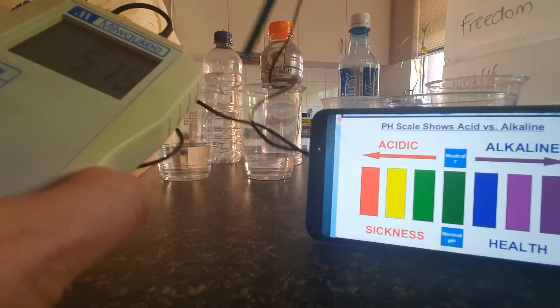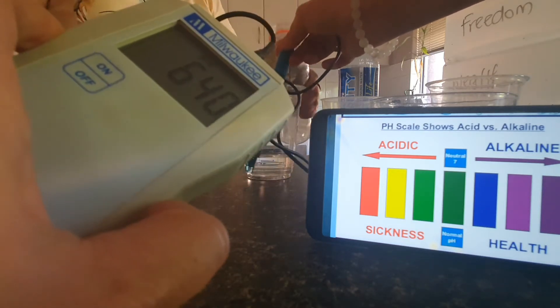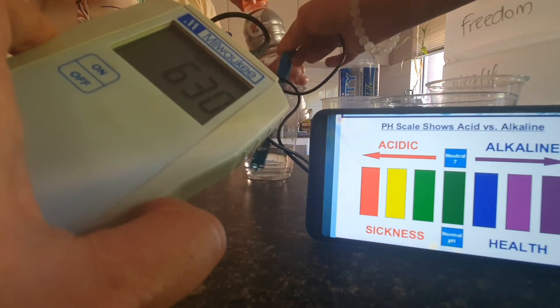We want things in the negative. And then the Gatorade — the Gatorade — that's gone into, wow, negative 630.